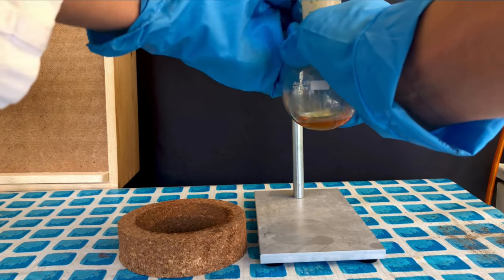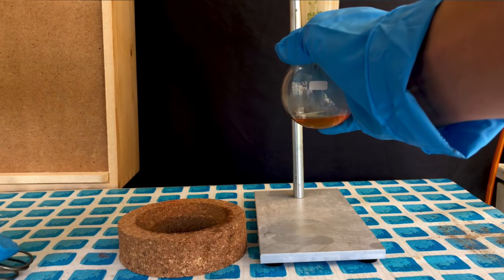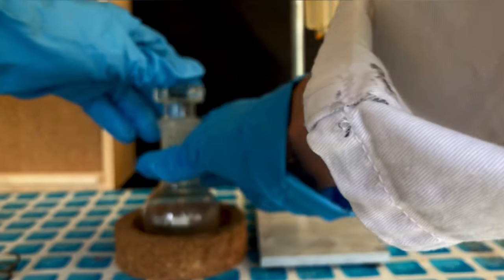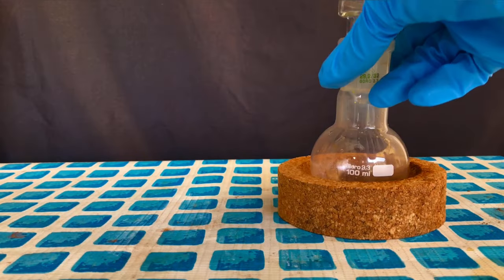The receiving flask was now disconnected, stoppered, and placed on top of a cork ring. You may have already noticed that the product is slightly discolored, while it should actually be perfectly clear.